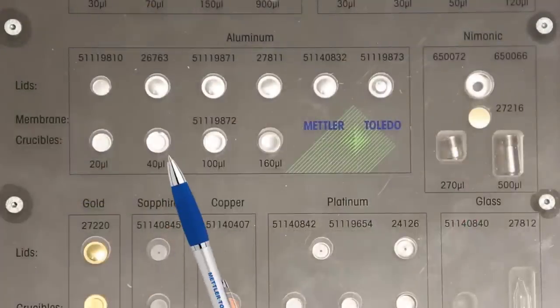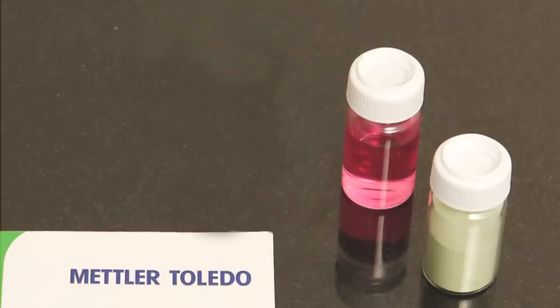We will use the aluminum standard 40 microliter and the aluminum 100 microliter crucible. Samples will be a powder and a liquid suspension.